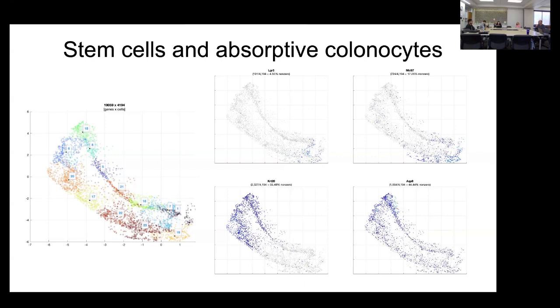So, Michael, when you get through all this, I think the first question you want to ask is, are any of these treatments affecting the atlas? In other words, are the abundances of the population shifting? Because you have a very unique biologic. He has a mouse that has no microflora in it. It was raised germ-free. People do this quite a bit, but it's a completely artificial environment, and the animal's still alive and generally thriving, but the biology is being massively impacted. Like you said, the immune system should be very immature, and the animal is clearly in a strange state.